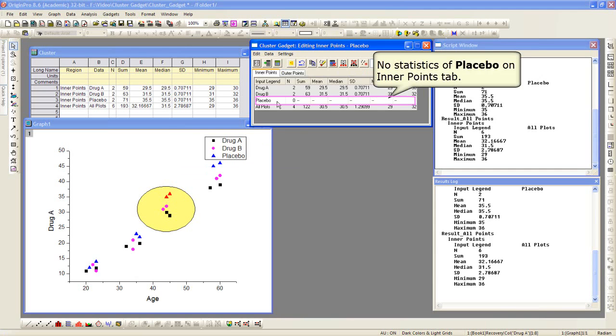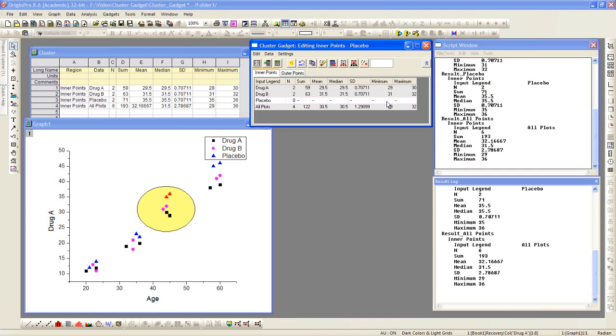And now with them masked, no statistics will be performed on those data points. Masking excludes that particular data or those data points from any analysis you would do.